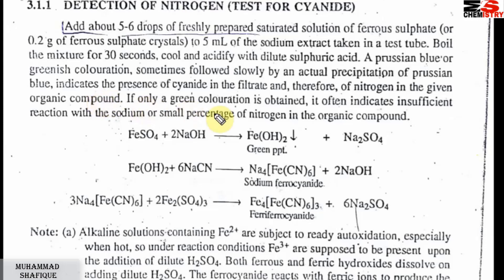If only a greenish color is obtained, it often indicates insufficient reaction. The greenish color comes from ferrous hydroxide precipitate. This means the reaction was not complete — it indicates a small percentage of nitrogen in the compound or insufficient reaction conditions.